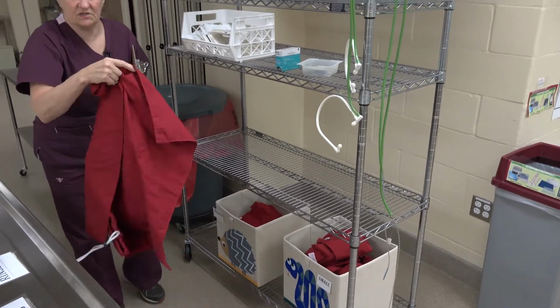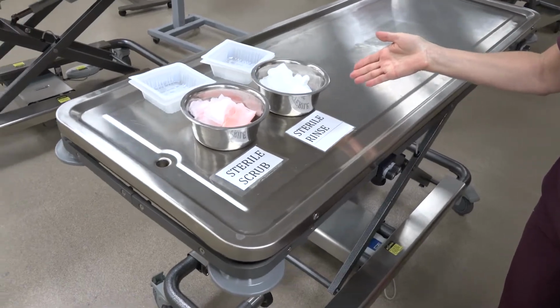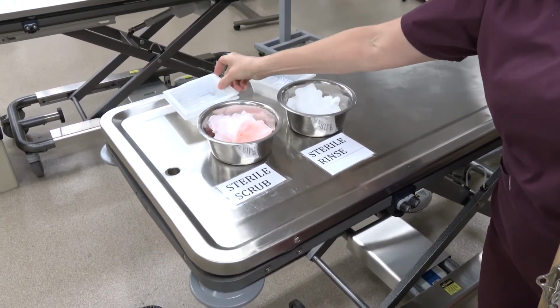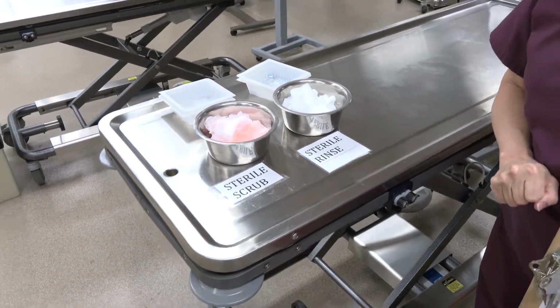So I'm going to get one of these. Also, your scrub is right here. So please take scrub and put it in these small containers and take it to your table. Don't take these with you.